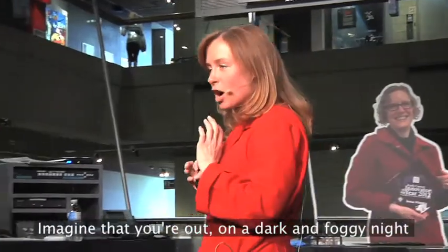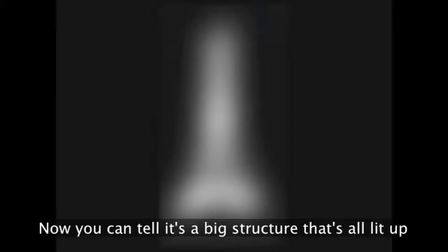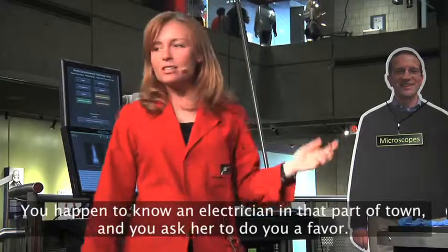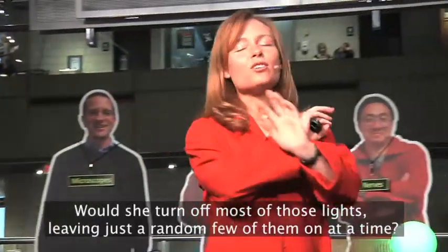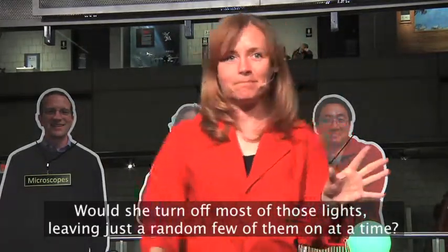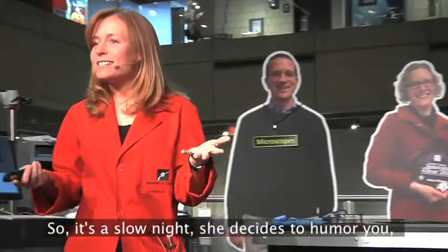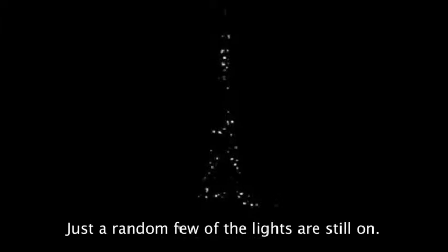Imagine that you're out on a dark and foggy night and you see this blurry apparition on the horizon. Now you can tell it's a big structure that's all lit up, but you can't really make out the details. Now, you happen to know an electrician in that part of town, and you ask her to do you a favor. Would she turn off most of those lights, leaving just a random few of them on at a time? So it's a slow night, she decides to humor you, and after she turns off most of the lights, this is what you see. Just a random few of the lights are still on.